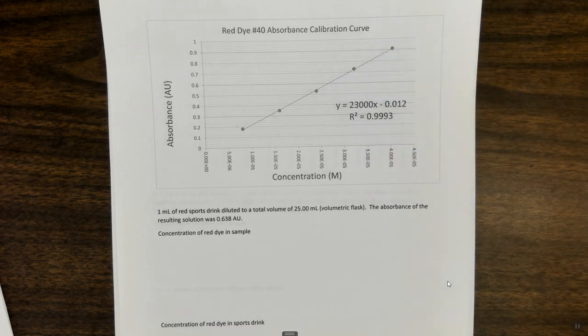That being said, you're going to use some blue food coloring. You're going to take about 100 milligrams of the blue food coloring, and you're going to put it in a 250 milliliter volumetric flask. And in fact, you're going to measure the exact amount of blue food coloring that you take. So make sure you write that down. You don't need to do exactly 100 milligrams. If you take 96.23 or 96.2 milligrams, that is totally fine. All right. So just take what you need.